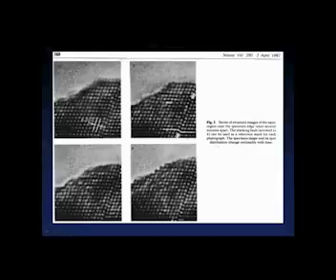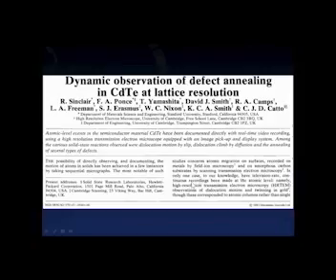So back then, the system did not have a video recording system, and what they did was to capture individual images as quickly as they could. The following year, the same experiments were repeated at Cambridge University, which also had a medium voltage electron microscope. I think it was probably about 300 kV or so, plus a real-time image pickup video recording system.